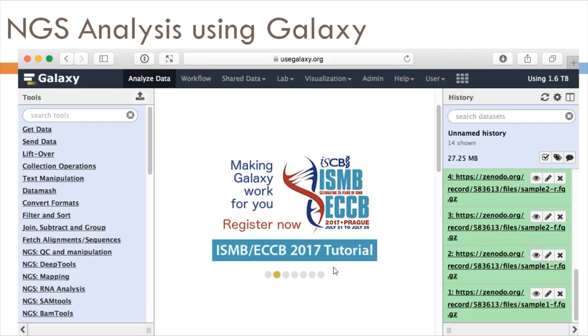So you see, as I told you, you don't have to bother about downloading, maintaining or installing the program. Within a few clicks, you can complete the data analysis, and you can focus on the actual biological question that you are thinking about. So using this Galaxy would make things very simple. Some of these tools might be outdated, but for learning, I think this Galaxy tool is more than sufficient. I suggest all of you have a look and go through this set of tools.